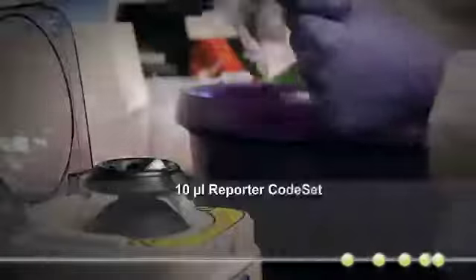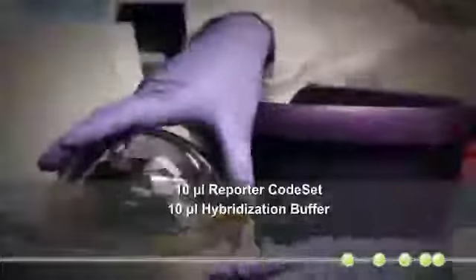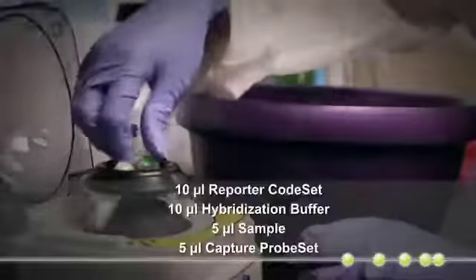Each hybridization will take place in a total of 30 microliters volume. In these 30 microliters, 10 microliters will be made up of reporter probes, 10 microliters by hybridization buffer, 5 microliters of your sample, and then finally 5 microliters will be made up of the capture probes.